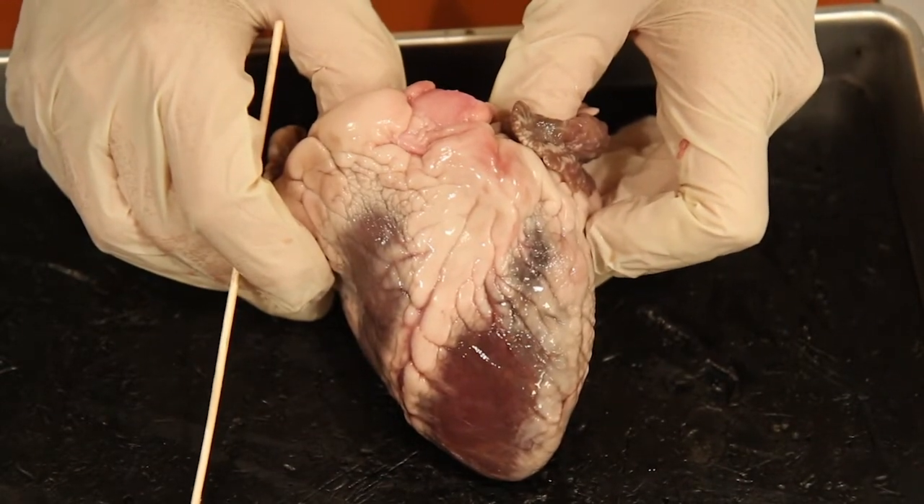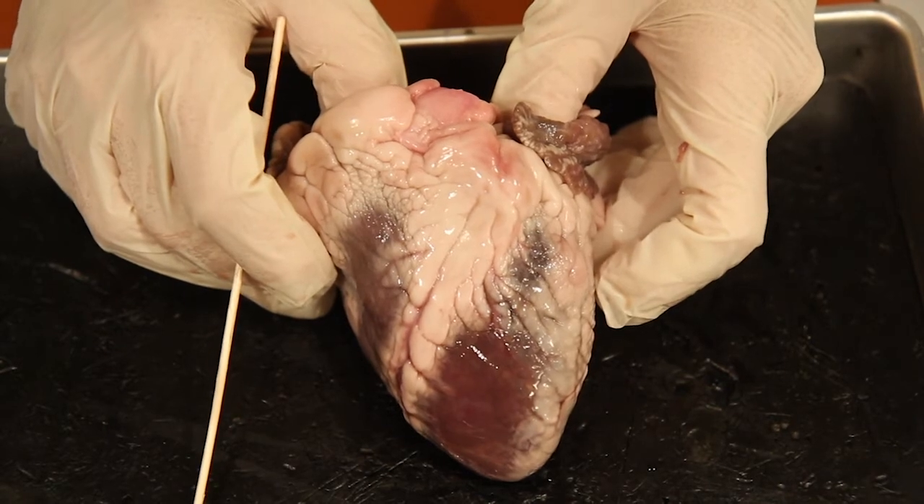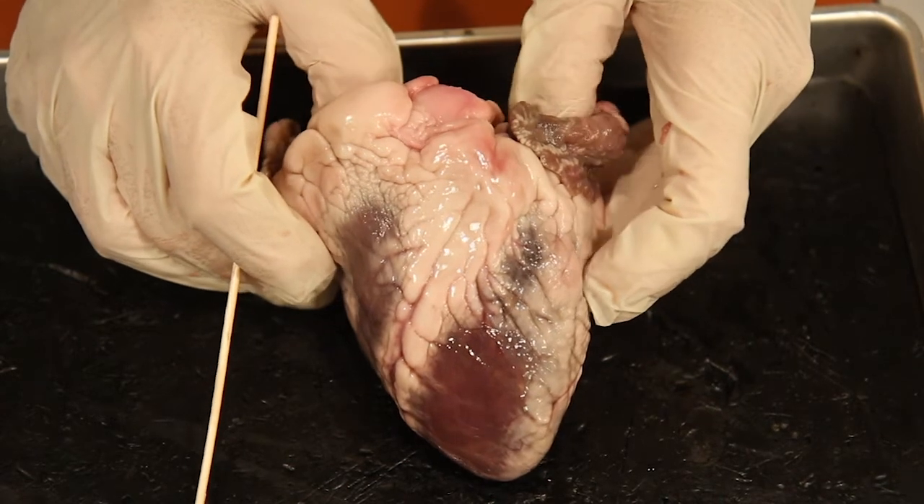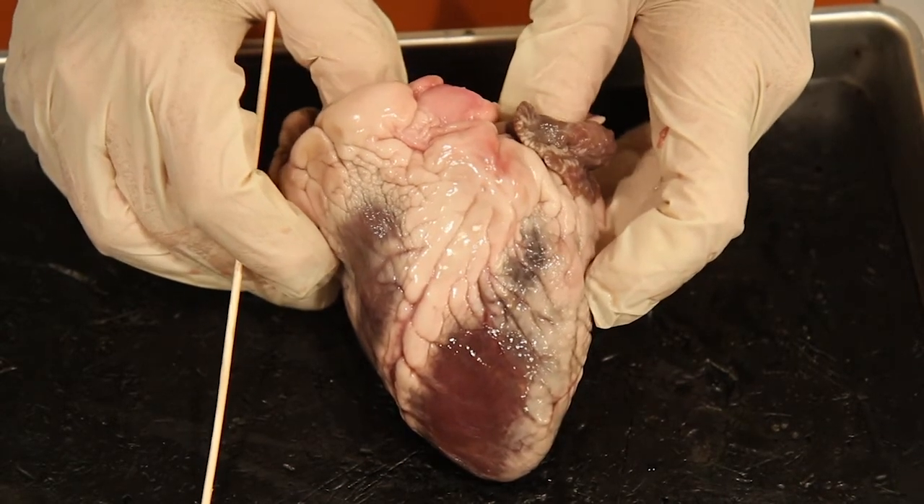The next two structures — the anterior interventricular artery and the great cardiac vein — I want you to eliminate those, scratch those out. You won't need to know those; they're harder to show.